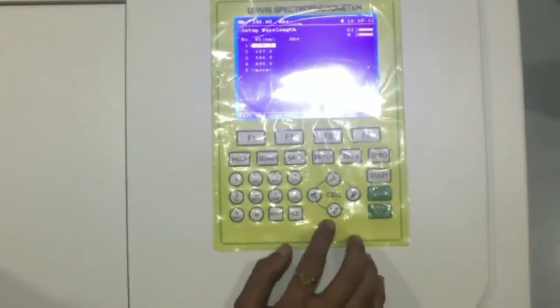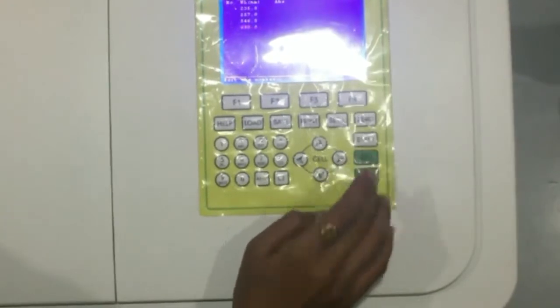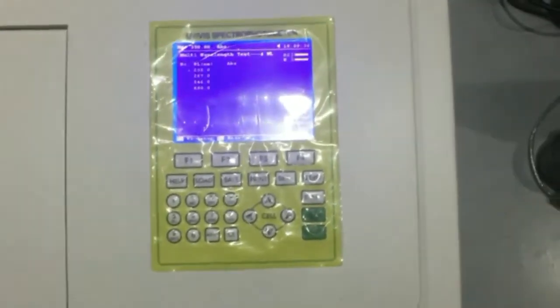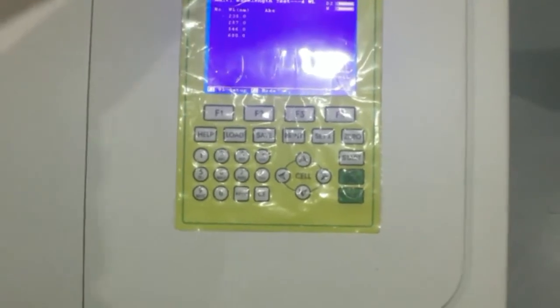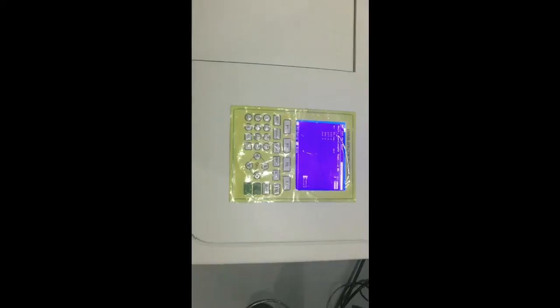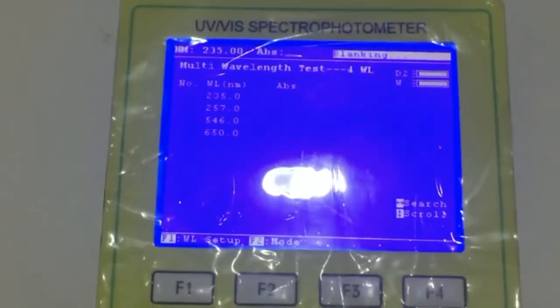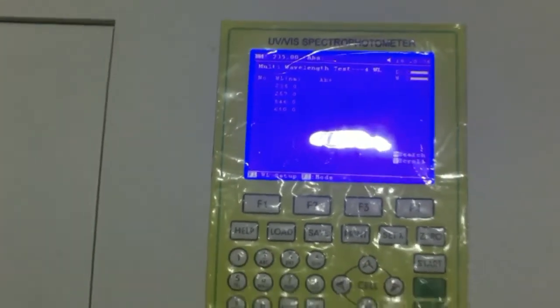Four wavelengths are selected for measurement of sample analysis: 235, 257, 546, and 650 nanometers. For distilled water, press zero. The status is blinking, indicating blanking is in progress.